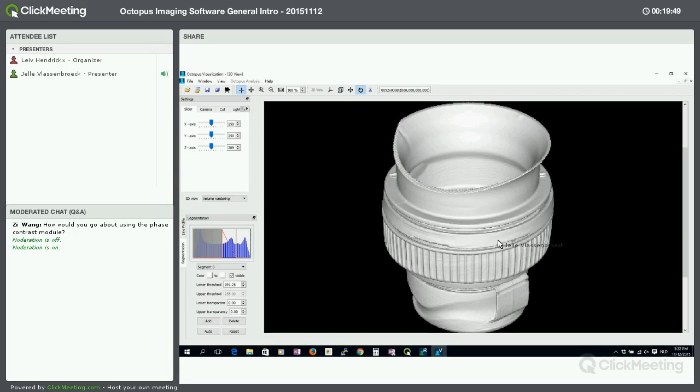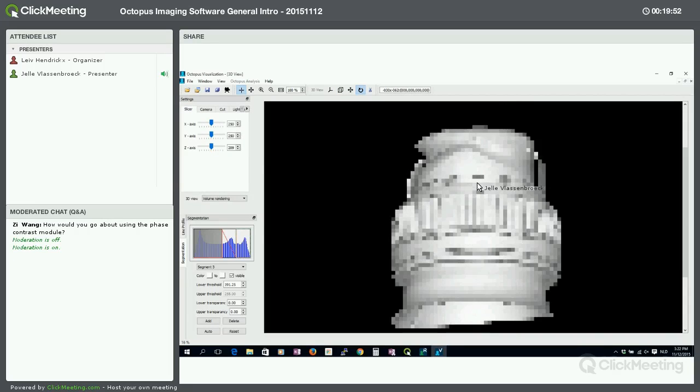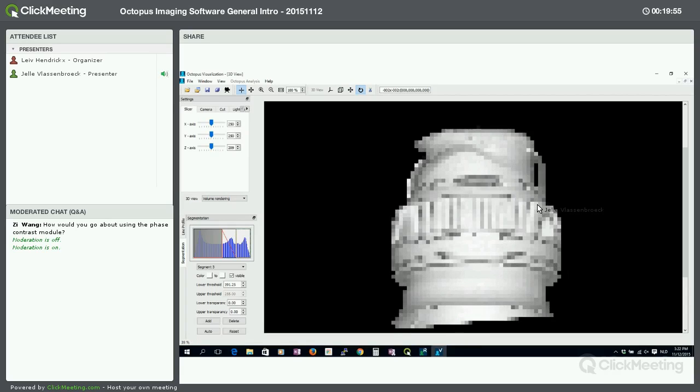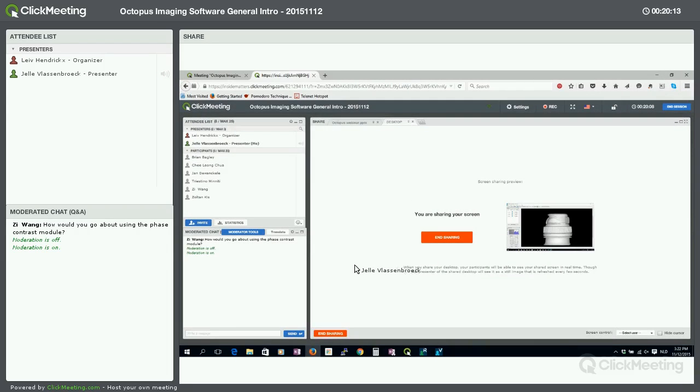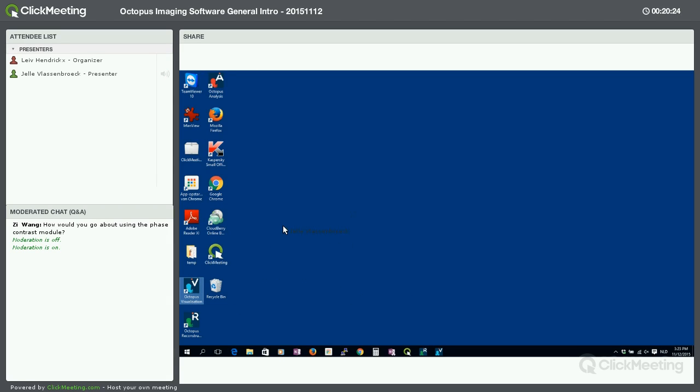And then you can also rotate it. So it's a good solution if you want, after reconstruction, to have a first visual idea about the sample. You can take a look at it, and you can also play a bit with things like filter settings and rendering options. So that's one of the things you can do with it, and afterwards, if you have a sample report, you can also use it for looking at the results. So I think those were the things I want to show about reconstruction. So I will now pass the word to my colleague Jan. He will show you the analysis package and go through a workflow there.